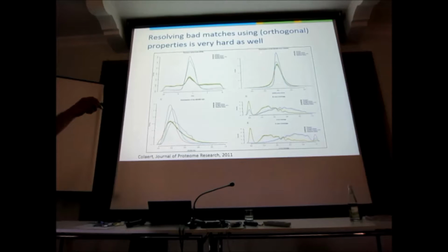And then here, this is the distribution of the MSMS error median. Okay? That distribution again shows a clear bias for these traditional decoys. It does not do that for the Photoshop peptides. Here too, this is the B ion coverage. Look at the massive difference that you get for these shuffled or reversed sequences. Look at the almost perfect overlap between the Photoshop ones and the original ones.